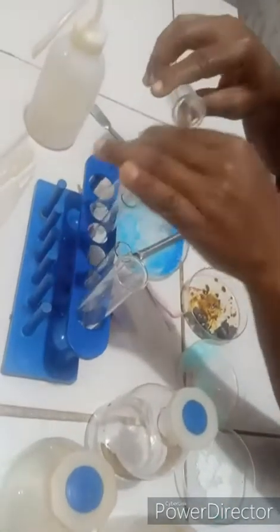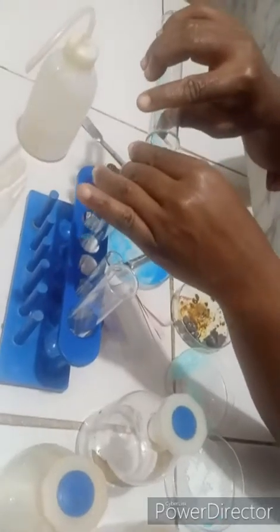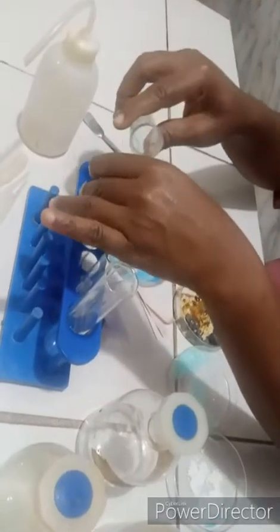Remember, I said in qualitative analysis, we don't measure. Take 3 portions out of your solution. Divide it into 3 portions. Okay. We've divided according to the instruction. To the first portion of the solution, the next instruction is add sodium hydroxide in drops and in excess.